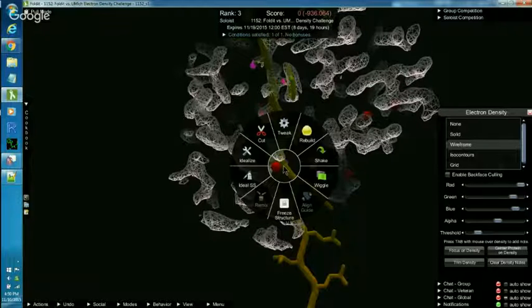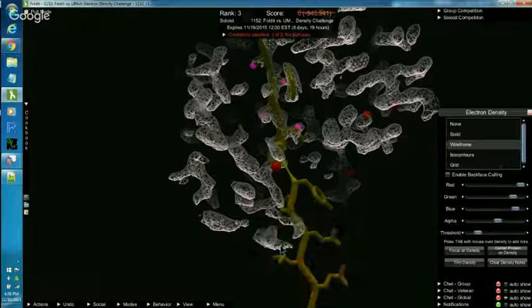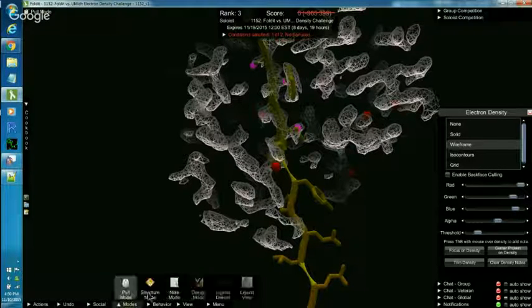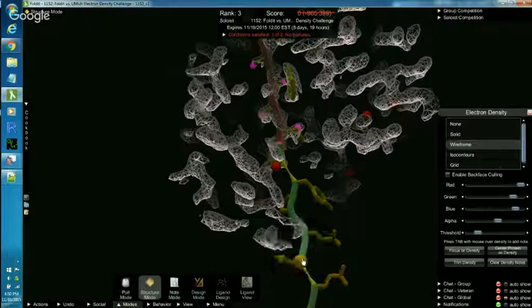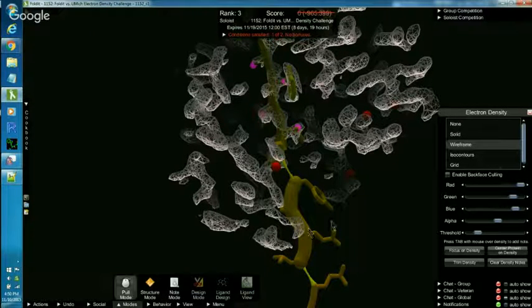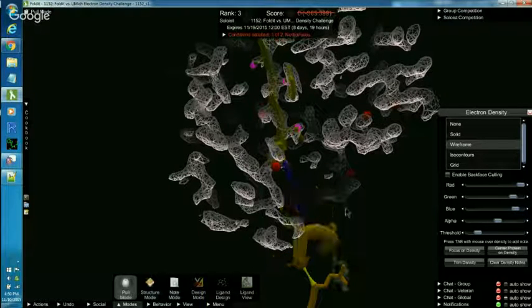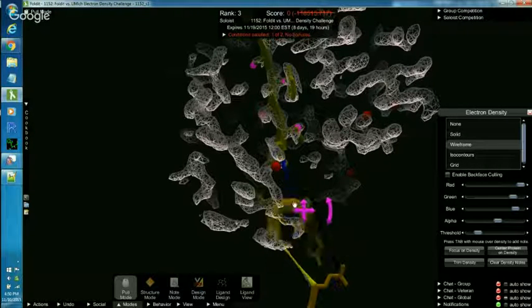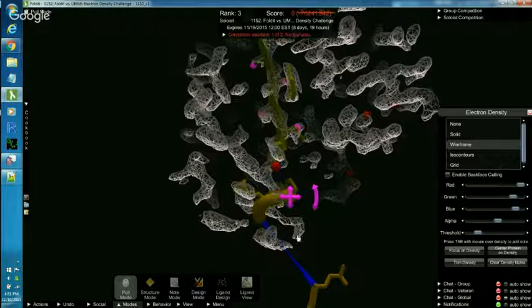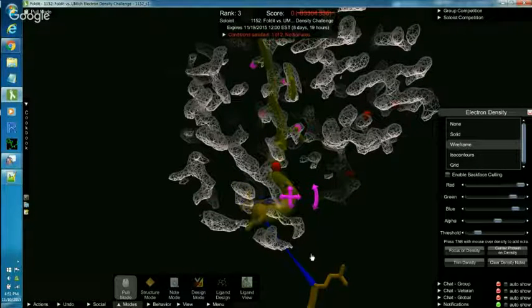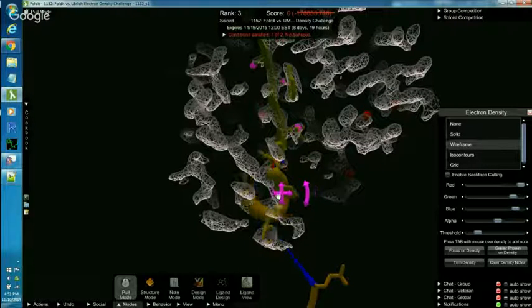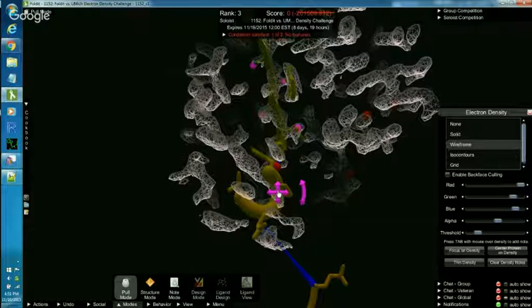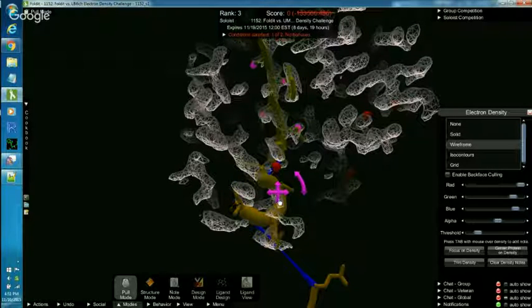I'm going to cut the backbone. Give myself, I don't know, four segments. And we'll change that to helix. And curl it up. And I want to fit that into this piece of cloud. Now I could have banded the side chain to there and used rebuild. But in this case, since it looks like helix, I decided to go ahead and make a helix to fit in there.